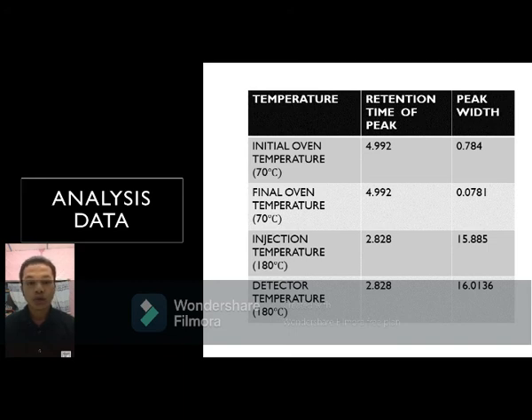Next, the table shows the retention time of different solutions. Retention time depends not only on the structure of the specific molecule, but also on factors such as the nature of the mobile and stationary phases, the flow rate of the mobile phase, and the dimensions of the chromatographic column. Retention time is usually characteristic for a specific compound in a given separation.